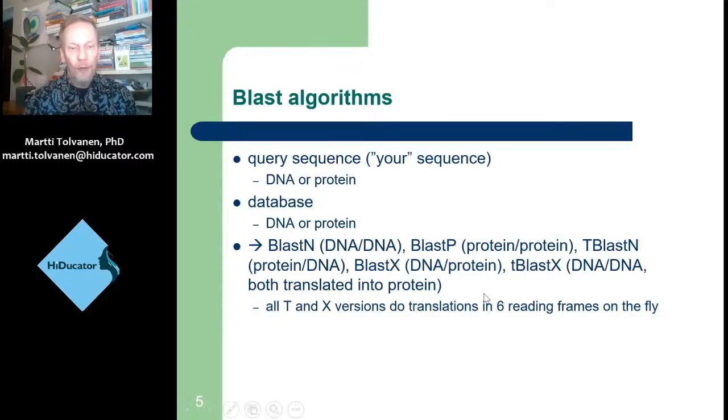There's BLAST-X for the other direction, and there's even tBLAST-X, which compares DNA to DNA, but compares translations in the query sequence and translations in the database.